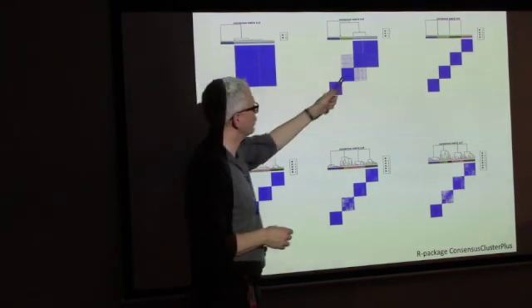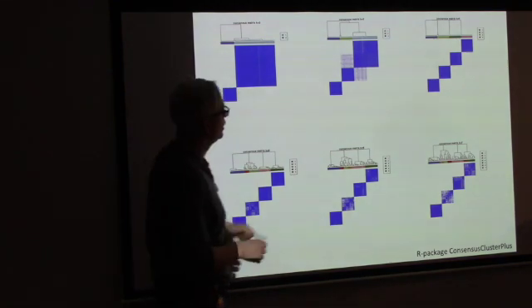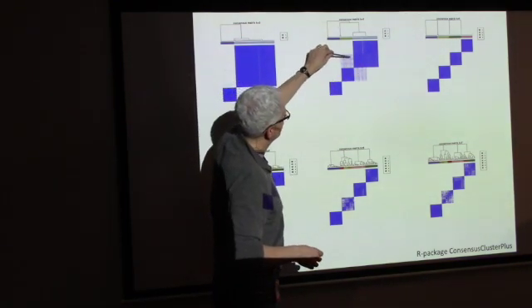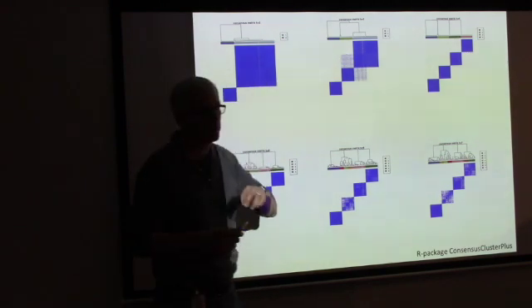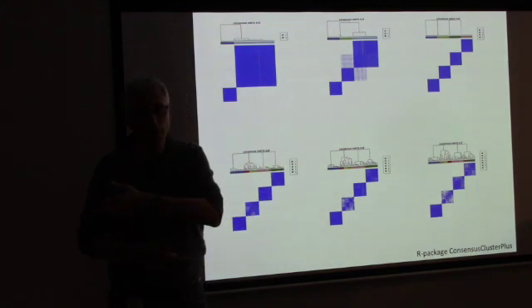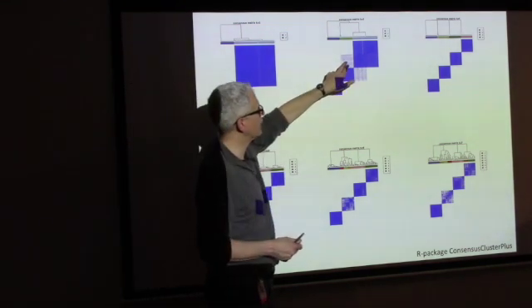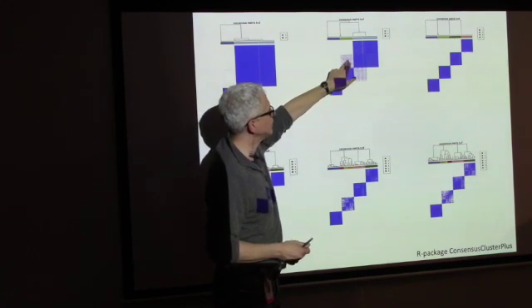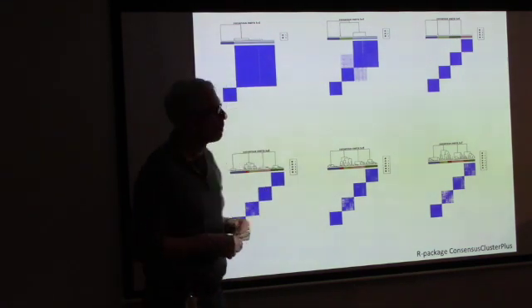When I tell it to find 3 clusters, you generally get 3 clusters, but there are pairs here where they're neither in it together always or out together always. Sometimes they're in it together, sometimes they're out, and that's why you get this middling color.